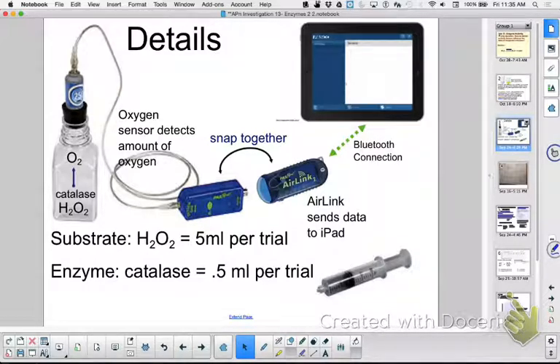Okay, so you have something that looks just like this, and then you're going to put your hydrogen peroxide inside of here. And if I'm going to do one, I personally would start with the control, so that way you won't have any residue in here. Okay, but just for the purposes of demonstrating this for you, in your boxes, you have 2 vials that look almost exactly the same. This one is marked H2O2. You see it? And the lid is also marked H2O2, so you don't mix the lid up with the container and possibly contaminate, right? And this one is marked water.